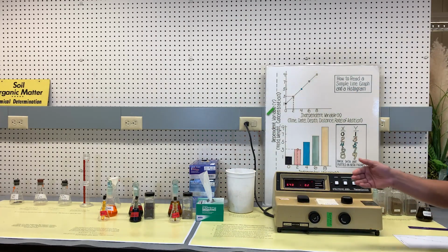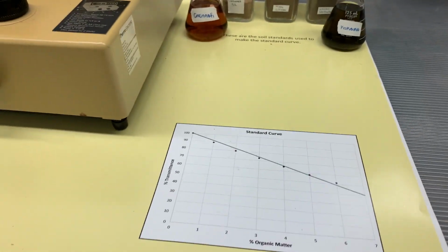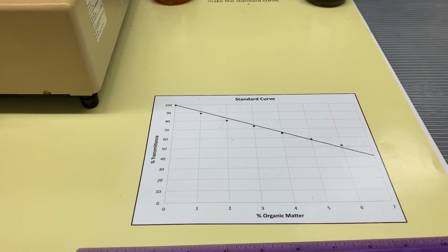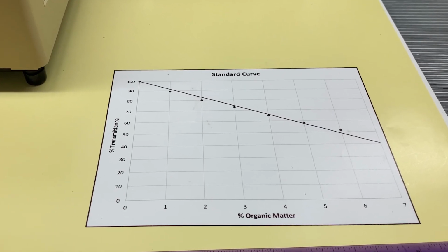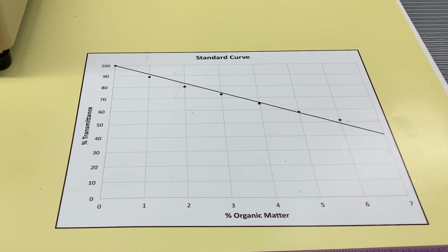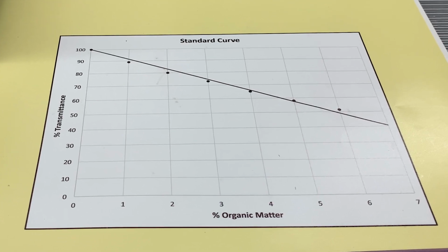So the next step is, we have these charts developed so that you can transfer the transmittance of the wavelength to the amount of organic matter. So around 85 will be around 1.5% organic matter, and then we have the other reading as well, so you can match it and then determine the organic matter content of the soil.